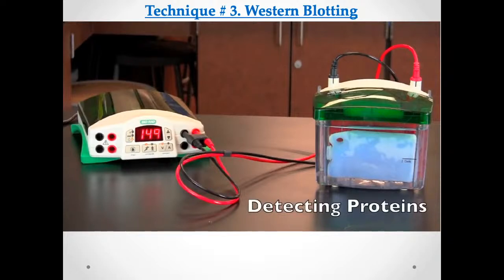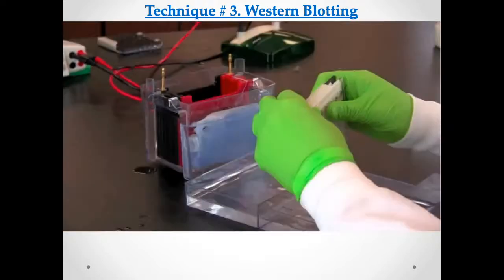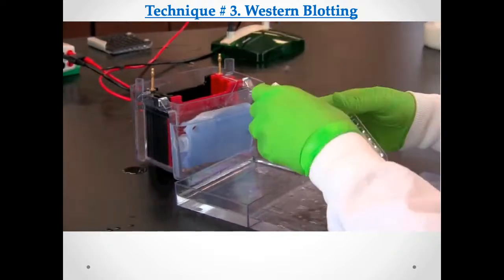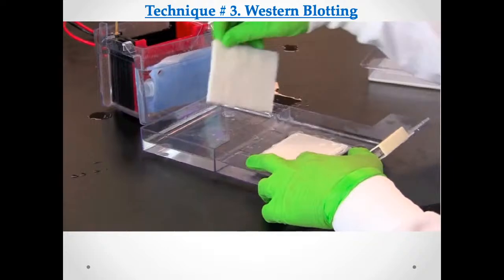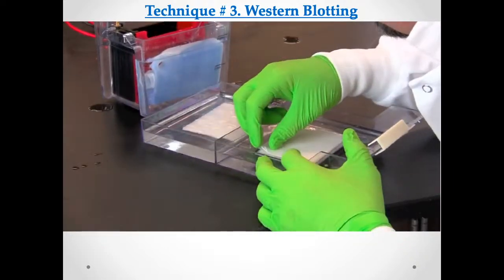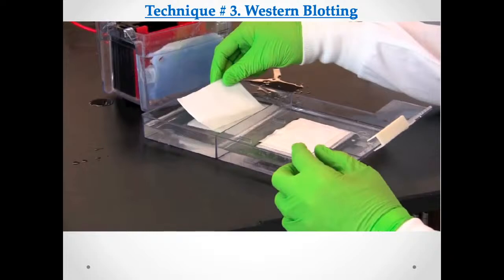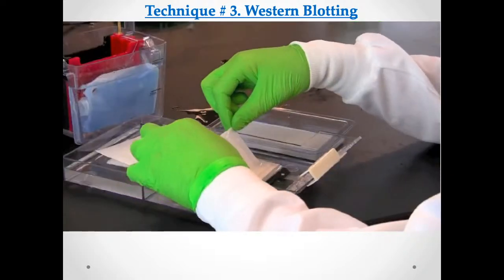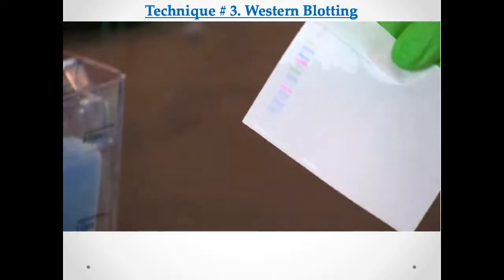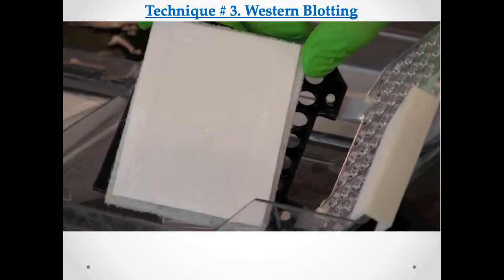When the run is complete, turn off the power supply, disassemble the electrophoresis chamber and remove the inner module. Open the module and place it in a container filled with blotting buffer with the black side down. Starting with the first fiber pad, remove each layer until you reach the nitrocellulose membrane. As you remove the membrane, note that the proteins have been transferred from the gel to the membrane. Note that the kaleidoscope pre-stained standards have been transferred and can be seen on both sides of the membrane. You can also see that there are no longer any proteins on the gel.